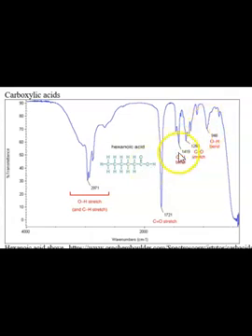Some of these over here, though, are a little too specific for what we do in high school organic chem. This is called the fingerprint region. It's very unique to this molecule. Okay? And then we saw some characteristic, very common structures. These peaks, for example, the carbonyl stretch or the carboxylic acid. So that wraps up our review of absorptions and spectra.